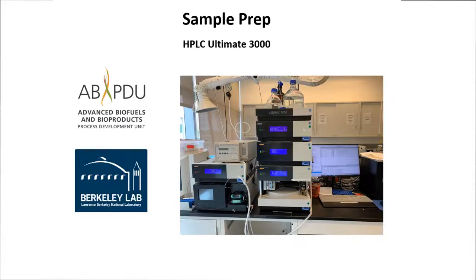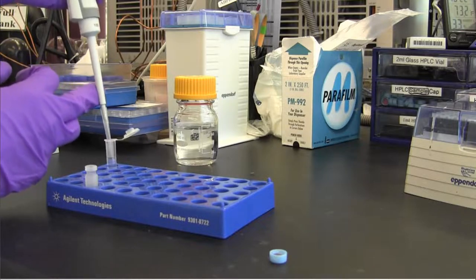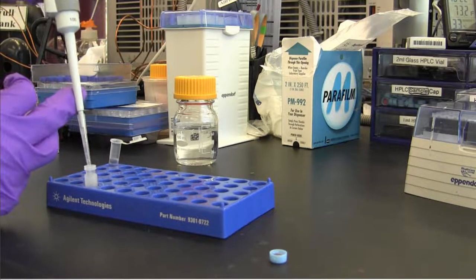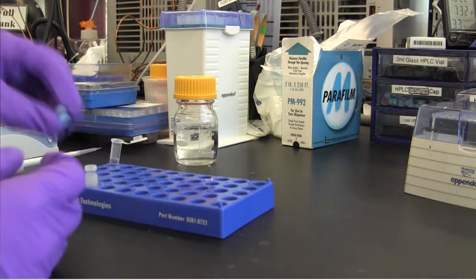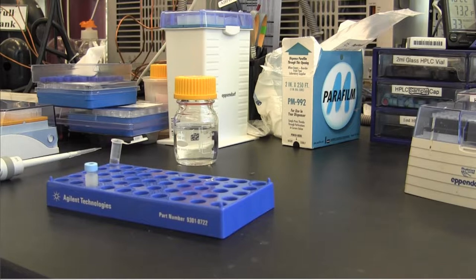If you are working with unknown samples, dilute the sample to make the estimated max concentration below 20 grams per liter. Remember to always vortex and filter the sample using a 0.2 micrometer filter before analysis. Ensure all samples are labeled properly and transfer them to the HPLC system.